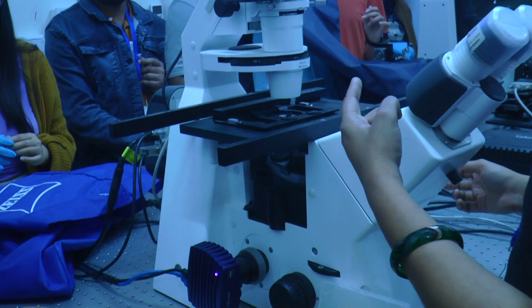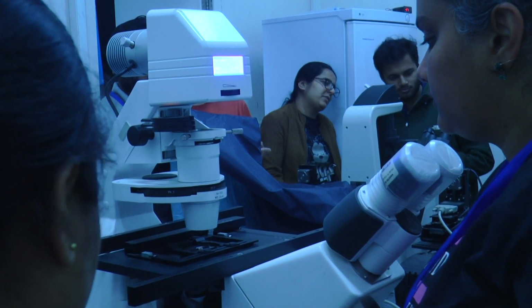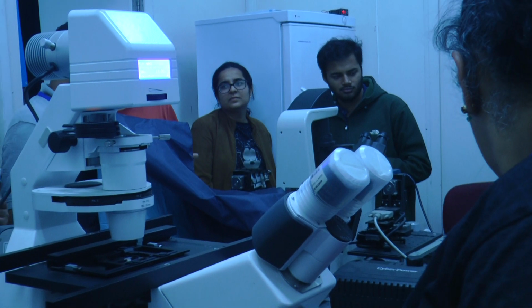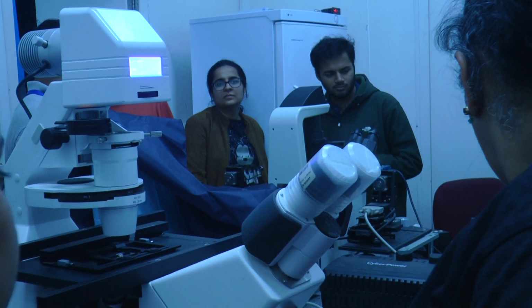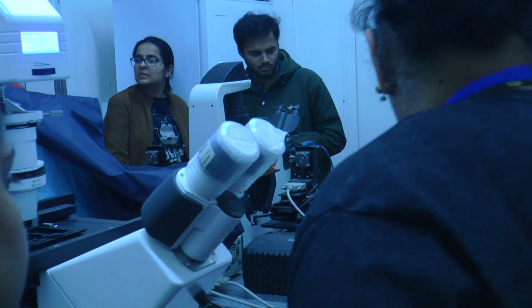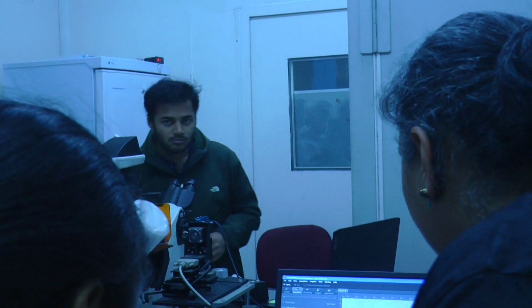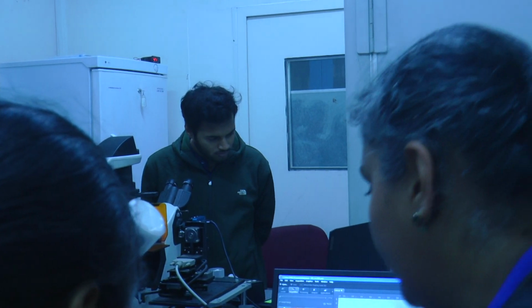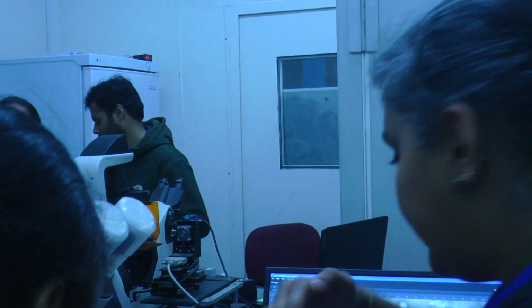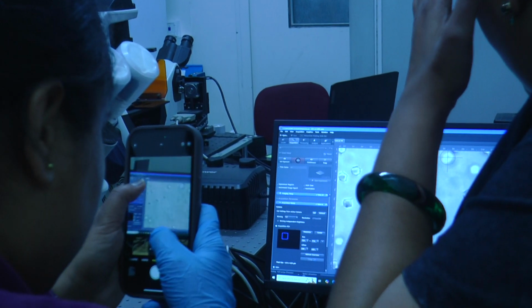This is 1.2. 0.6. Can you see the bloating? The center region is gone. When you are focusing out and in, you cannot see the dimple region. It's all bloated like a balloon. Okay, wait a minute, all of them are bloated.